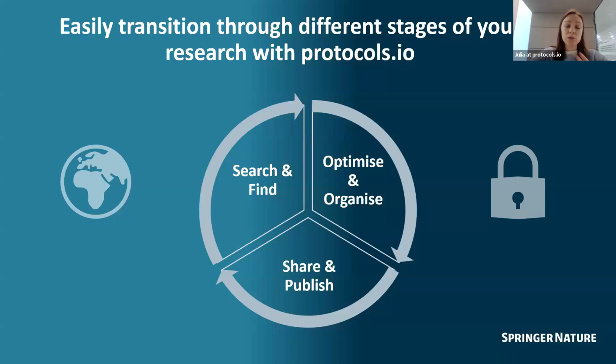What you'll perhaps get the sense of is that these public and private sides of the platform really feed into one another. The protocols on the public side can be reused by bringing them into your private workspace via a new version or fork, where you can then build upon them and adapt them for your own lab or research. And then as you're working on the protocols privately, when you are ready to make them open, it's very easy to push them public. They're already in the format needed for publishing. You just click that publish button and push them public.